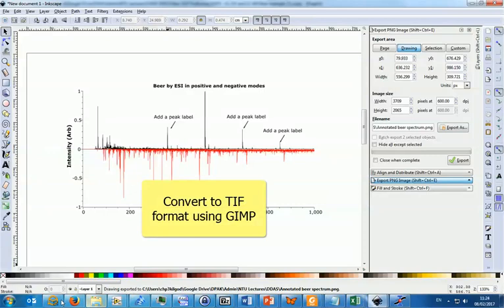The figure has now been saved as a PNG file, but unfortunately you can't upload that type of image to a journal. We need to convert that to a TIFF format file, and to do that we'll use a freeware program called GIMP, that's the GNU Image Manipulation Program. There will be instructions on how to download GIMP in the notes as well.